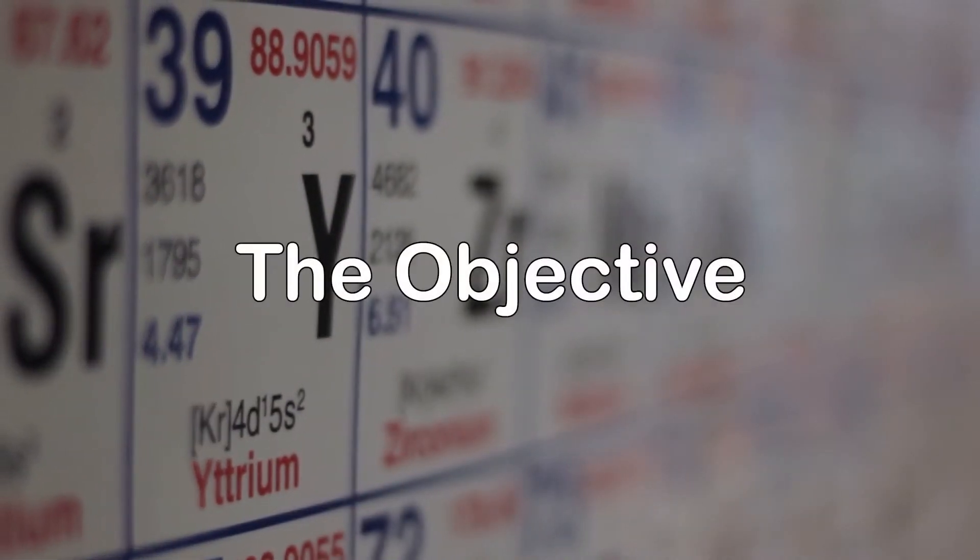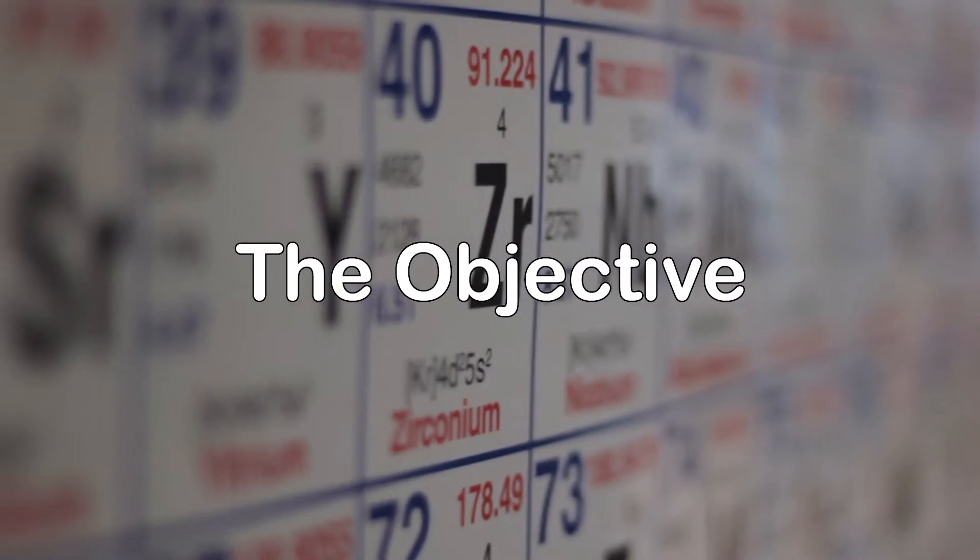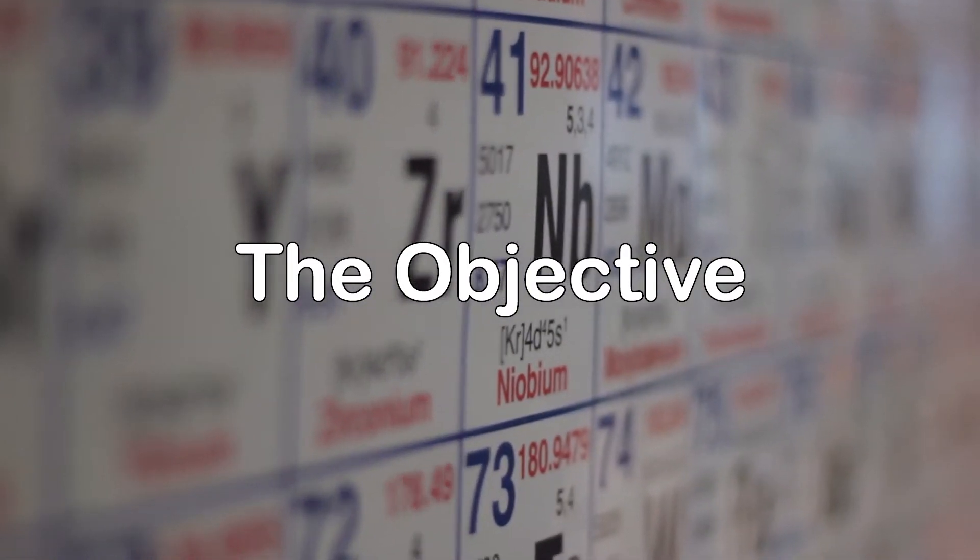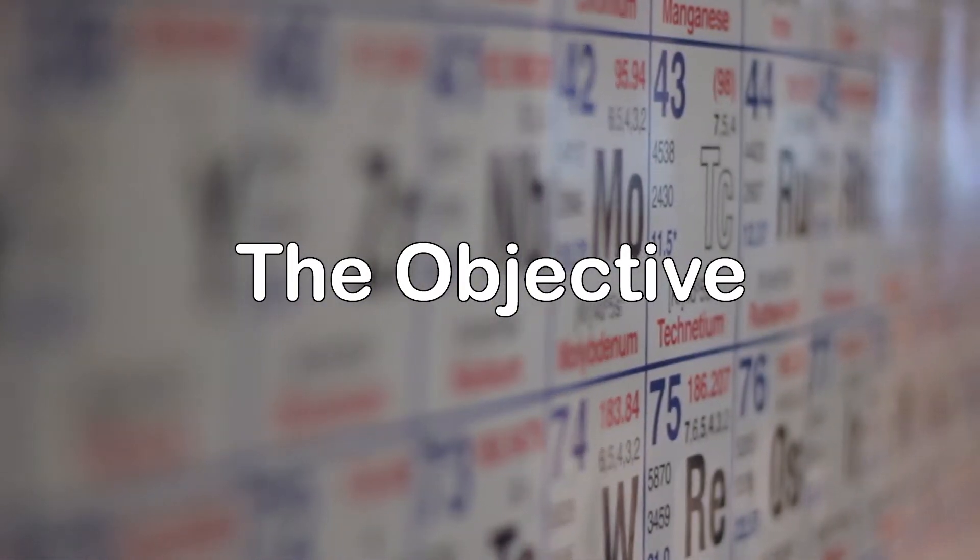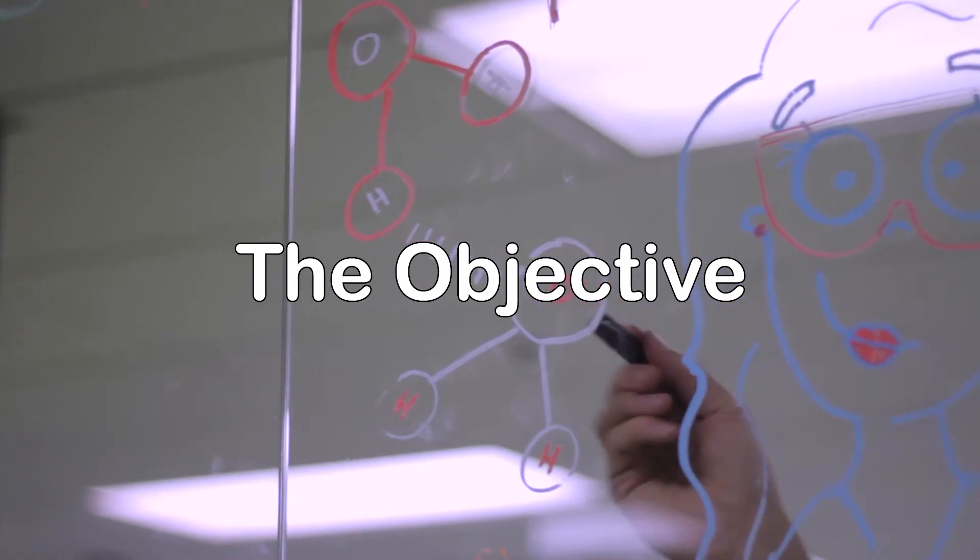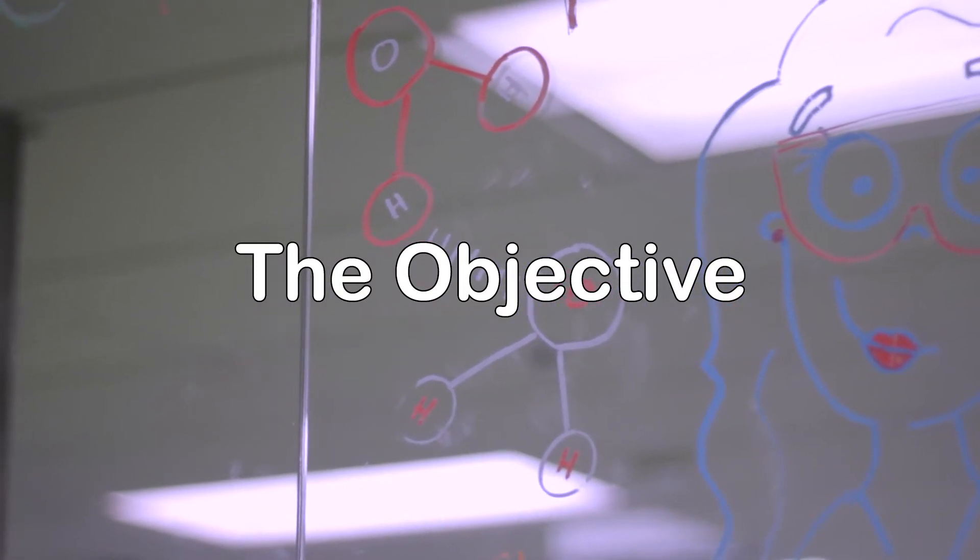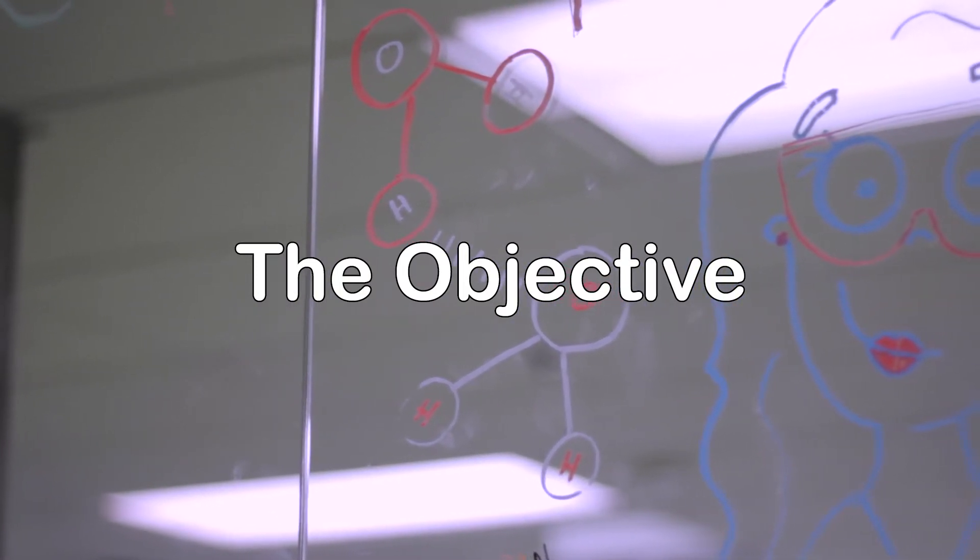Calorimetry. There are two parts to this experiment. In part one, the objective is that the enthalpy of solution of sodium hydroxide is measured. In part two, the enthalpy of neutralization of an aqueous solution of sodium hydroxide by hydrochloric acid is measured.